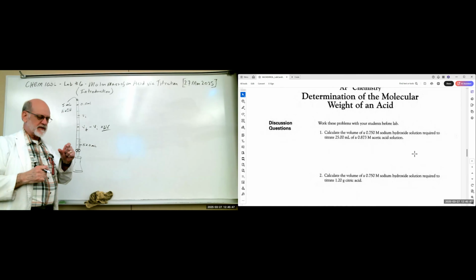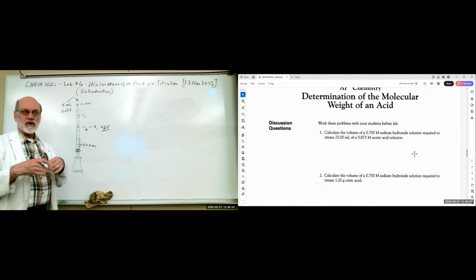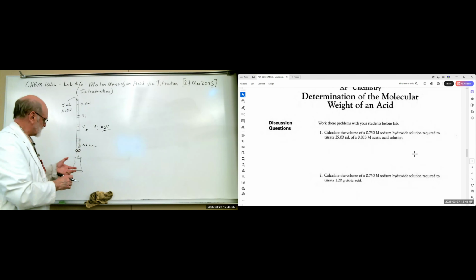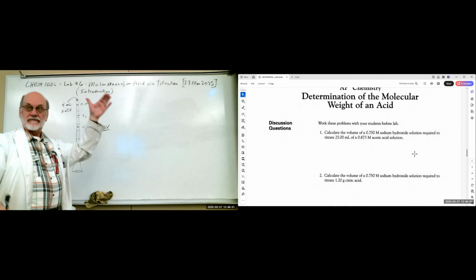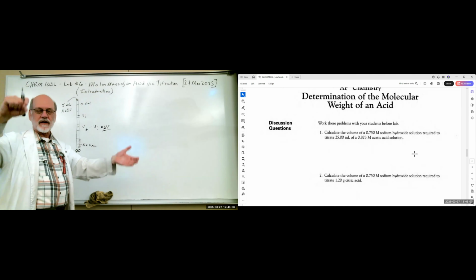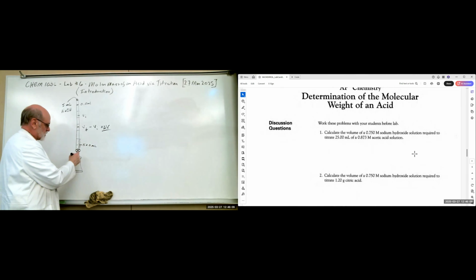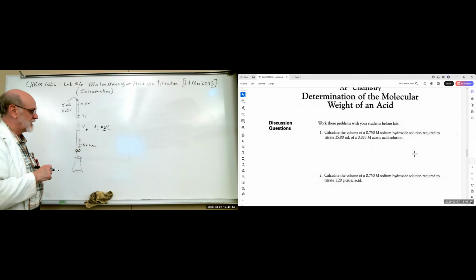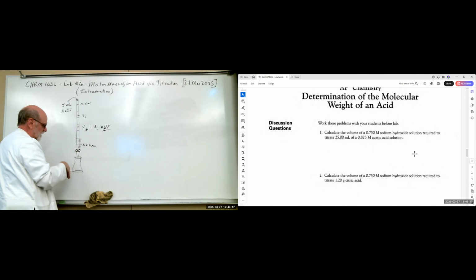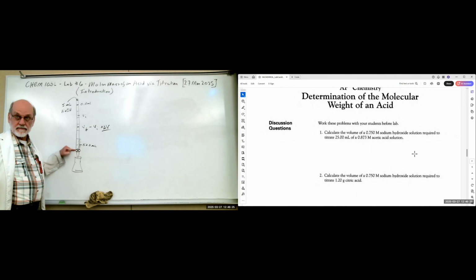you can use a piece of parafilm if you want, tap it over the top. But I say, if you just put on your gloves, the gloves are clean. So I just take it out of its holder and put my palm over this and rock it. And then rotate a third, rock it again, rotate a third, rock it again. And that will coat the inside. And then you just drain it out. And then you do it again. So you do it twice. And once you've done the second one and drained it out, what you want to do is stop it when it gets right down to the stopcock.